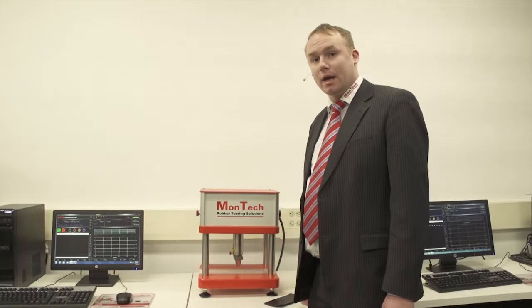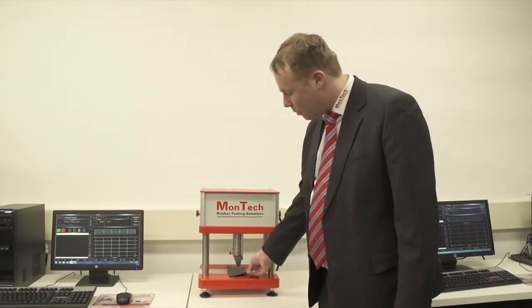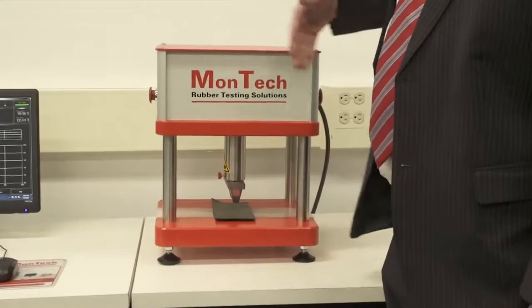Preparing samples is really easy. You just take a sheet of molded cured rubber, position it underneath the knife, and hit both buttons simultaneously.